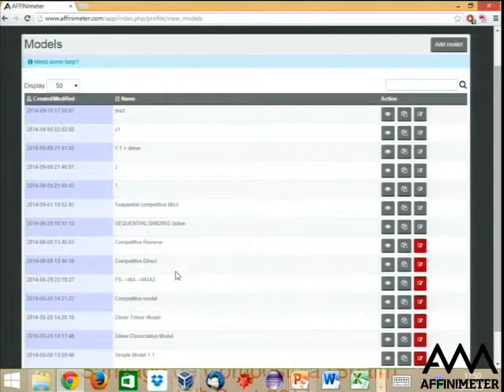Okay, so this is basically all I wanted to show you about how to design binding models with the reaction builder. And I may show you an example before finishing. This example that I call 1-to-1 plus dimer I made myself, just to show you how we can design very easily binding models that correspond to realistic situations.